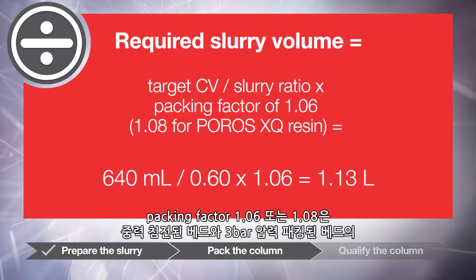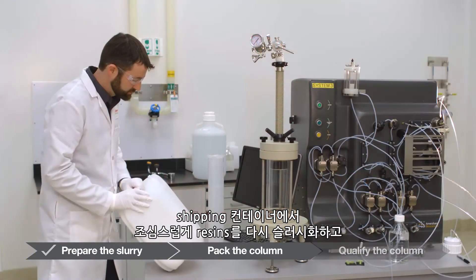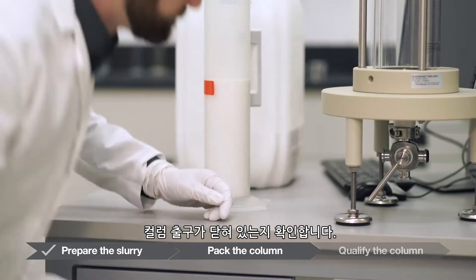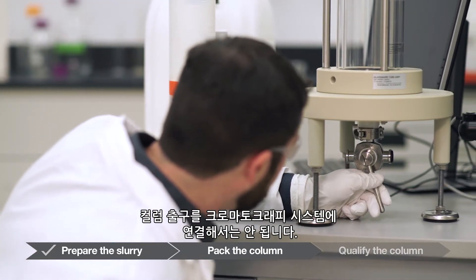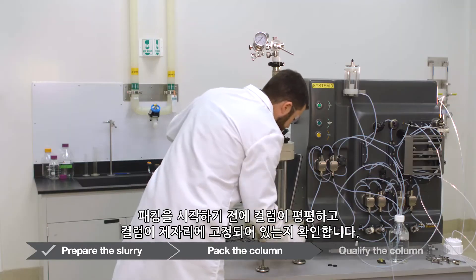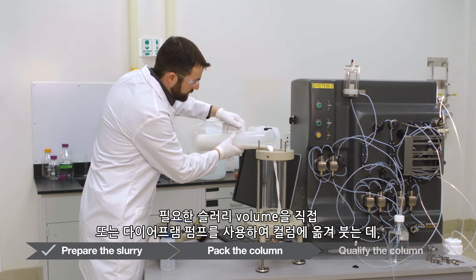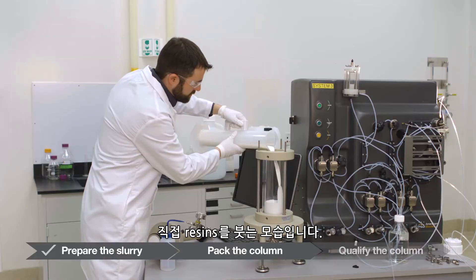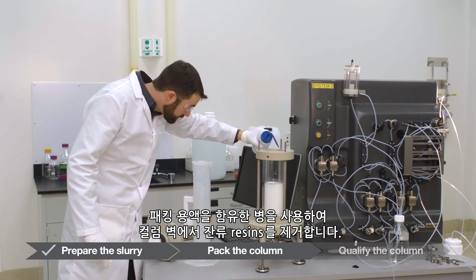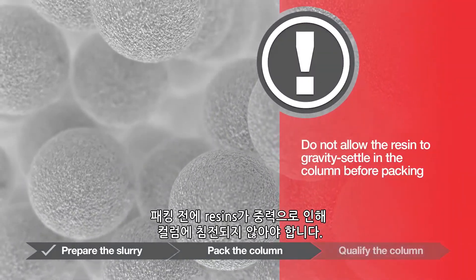The 1.06 or 1.08 packing factor accounts for the difference in bed volume between a gravity settled bed and a 3 bar pressure packed bed. Gently re-slurry resin in the shipping container and pour the calculated volume into a graduated cylinder. Ensure that the column outlet is closed and do not connect the column outlet to the chromatography system, as plumbing into the system creates back pressure that fights against the inlet pressure. Ensure the column is level and locked in place before beginning the pack, then deliver the required slurry volume to the column by hand or with a diaphragm pump.